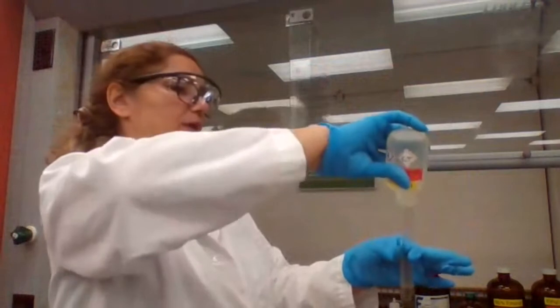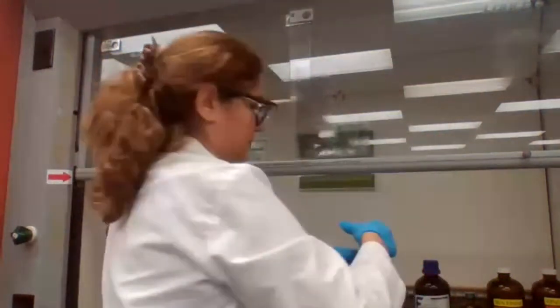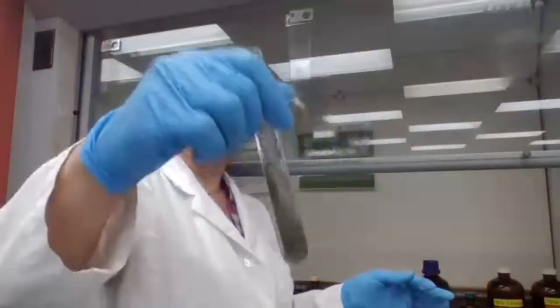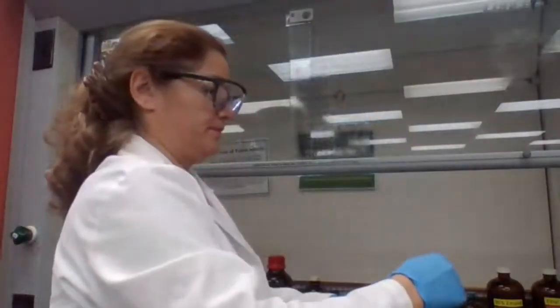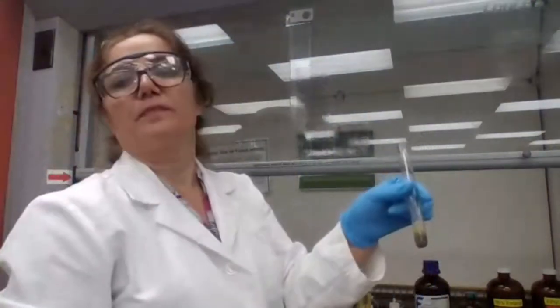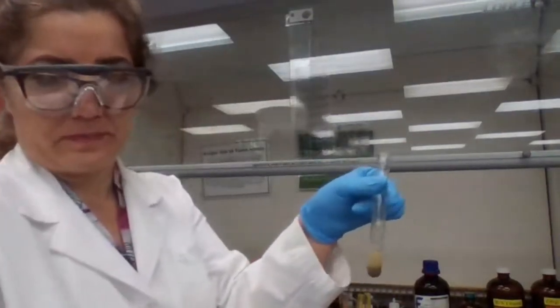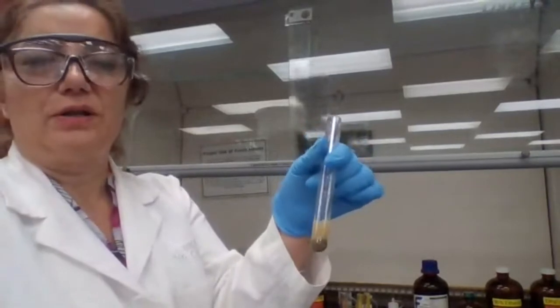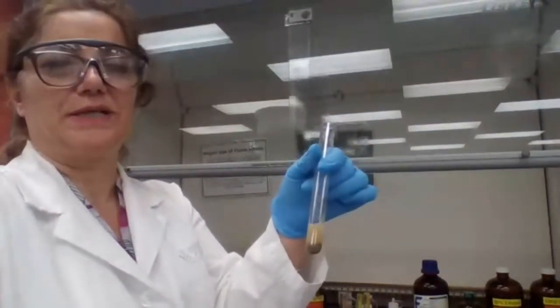I'm sorry, not yellow, a gray-brown precipitate. What should I add now to make the Tollens reagent? This is not the Tollens reagent yet. What should I add to make it Tollens reagent?